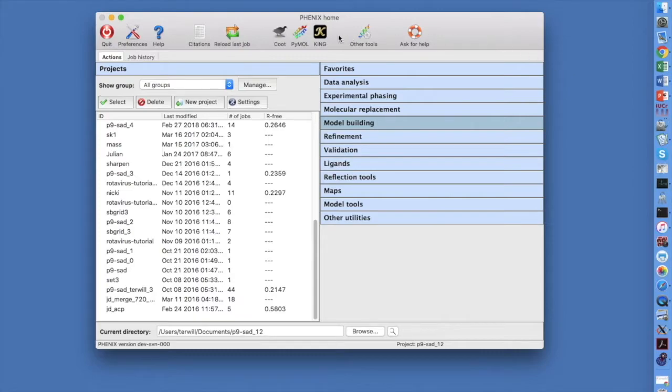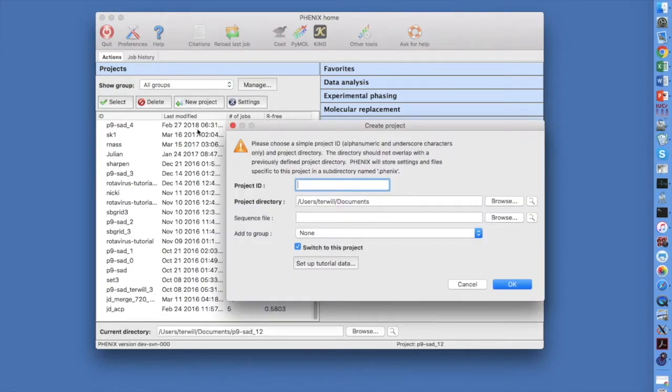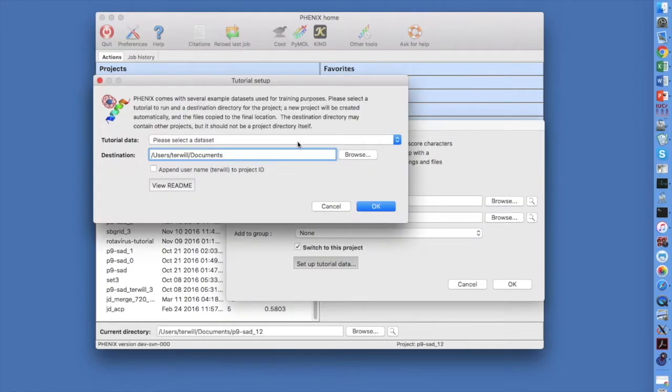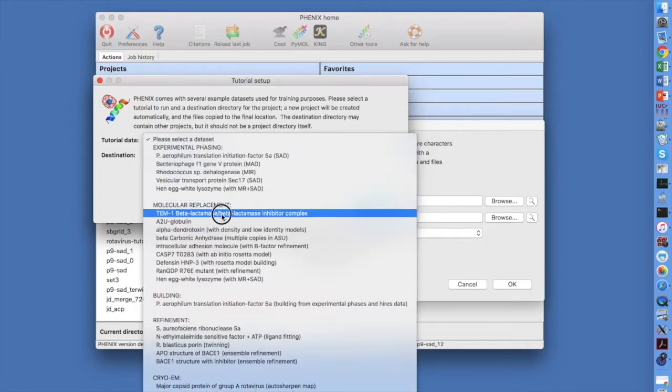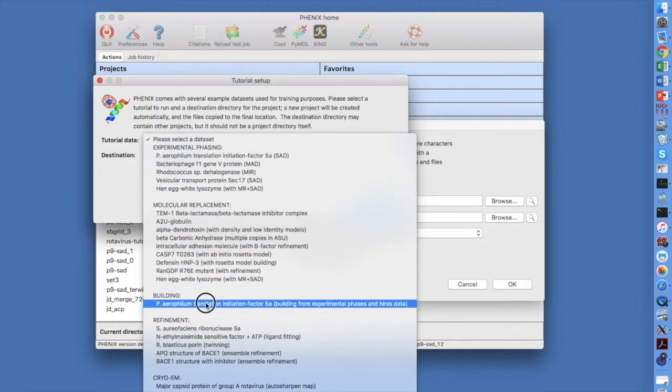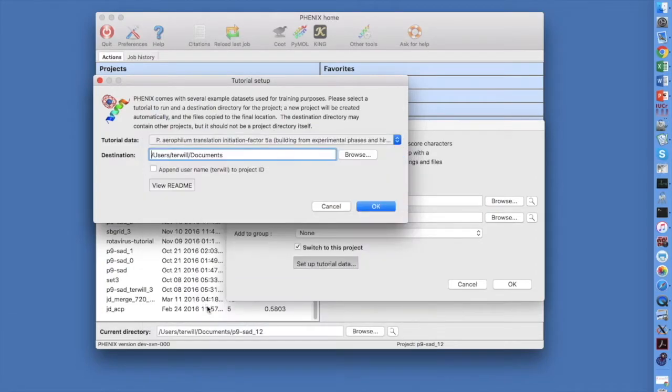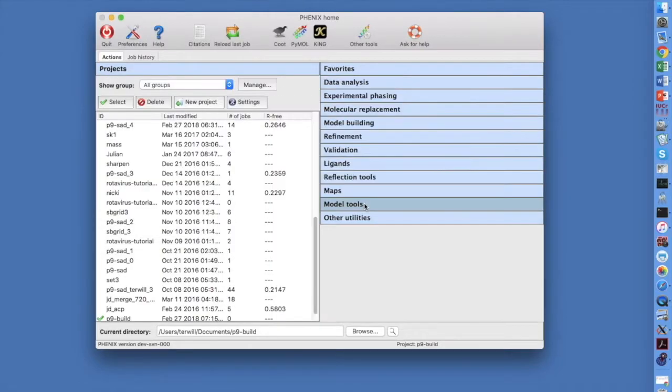In the main Phoenix GUI, click on New Project, then Setup Tutorial Data and choose the first tutorial under Model Building. Select a suitable location to put this folder and click OK.